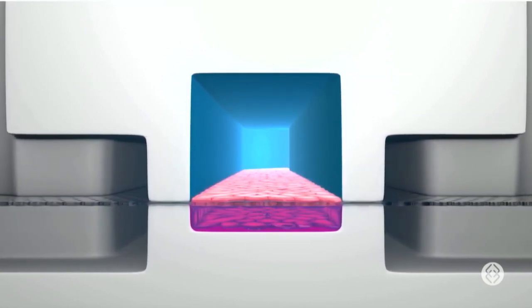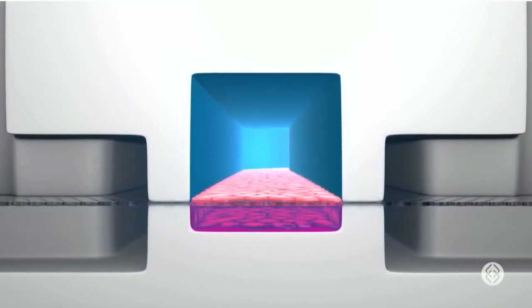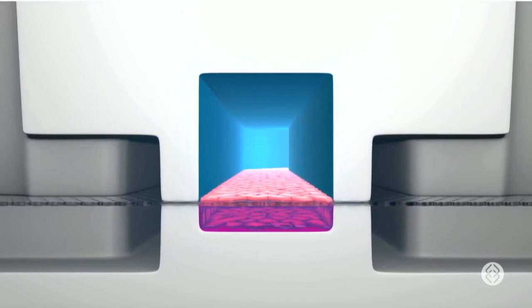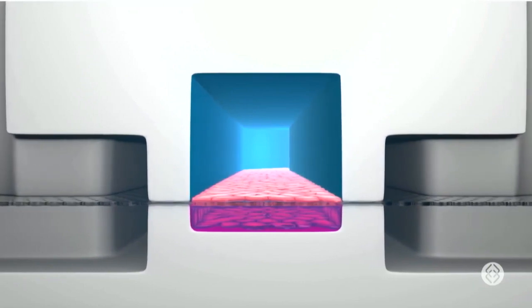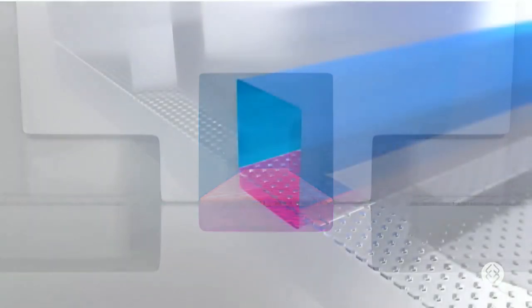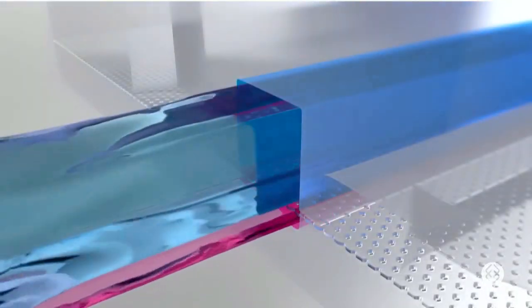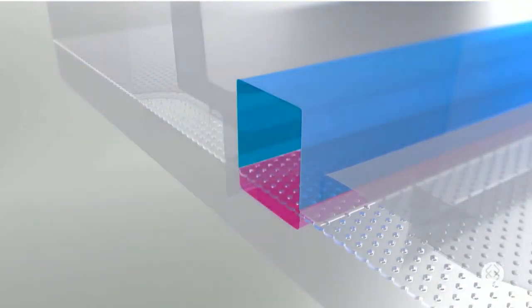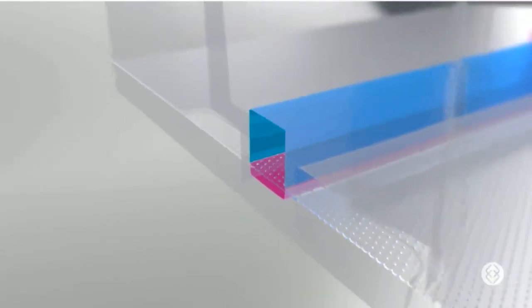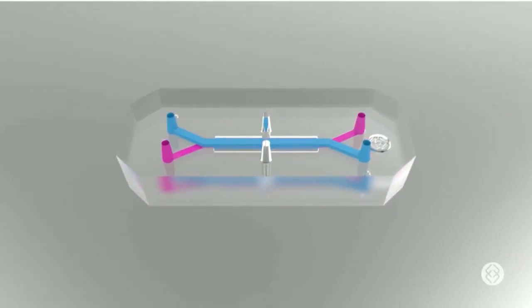These are co-cultured and co-matured and subjected to mechanical inputs like cyclic stretch, which models the peristalsis in the gut or the breathing of the lung. And then we perfuse the channels with media, which allows nutrients and target agents to be delivered, but also provides the input of mechanical forces that are relevant for differentiation. So that is the fundamental starting point that we work with.